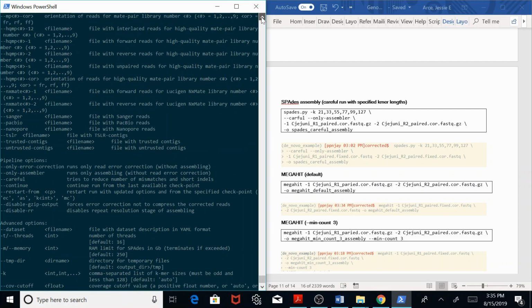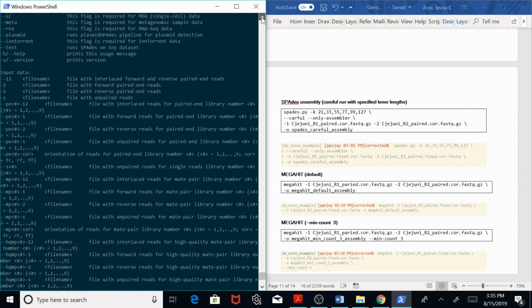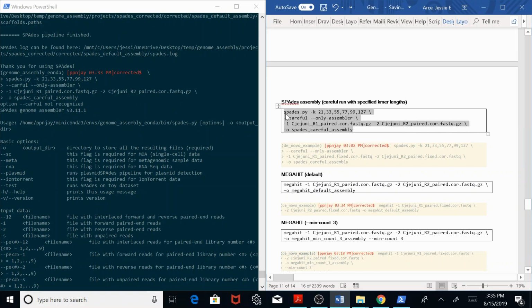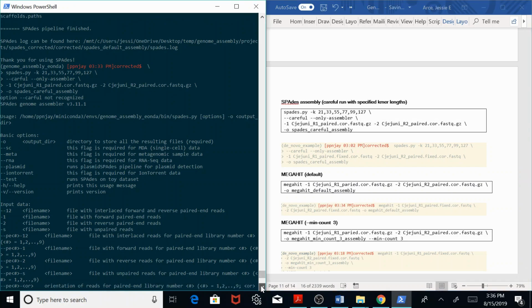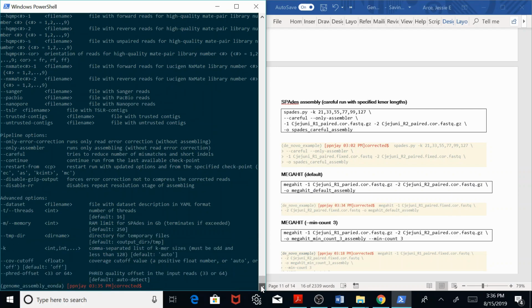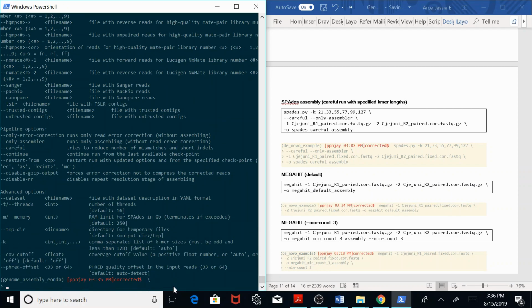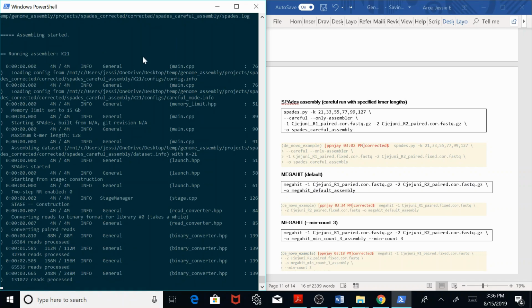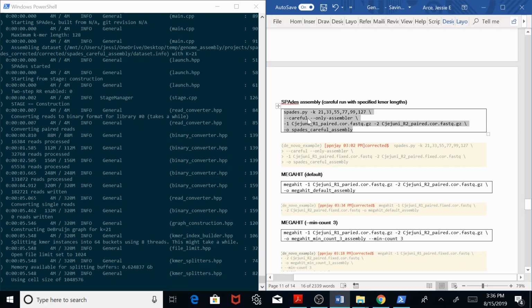Looks like it did. What happened here? There we go. Okay, a misspelling. Good. Okay, so try this again. You won't have to worry about this, you'll get the document with all the errors fixed. And then here we're running the assembly again, but with a few different parameters added.